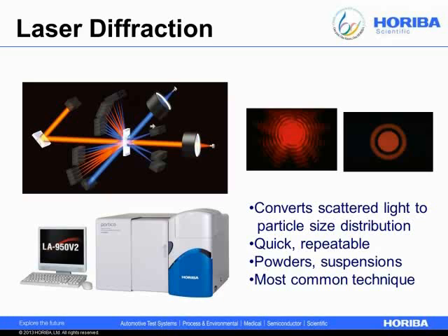So we have a wide array of detectors from nearly 0 degrees to 166 degrees. And their only job is just to measure the angle, the intensity of the scattering. We know the angle. And so that's all this instrument is actually doing. That's all any laser diffraction instrument does, is collects that information. And then it moves it over to the computer, which has the algorithm, which will then convert that scattered light to a particle size distribution.